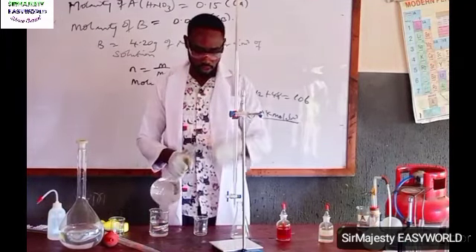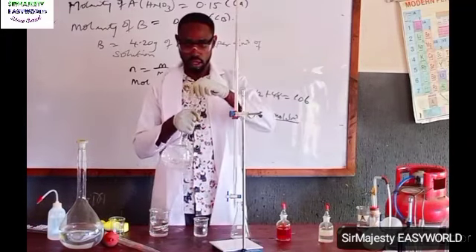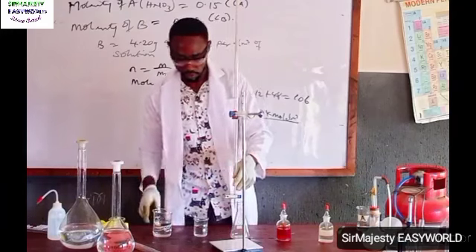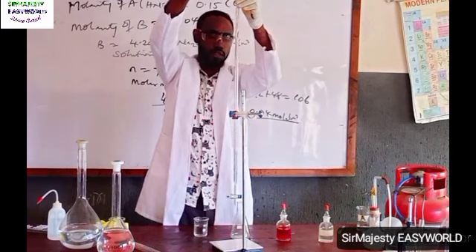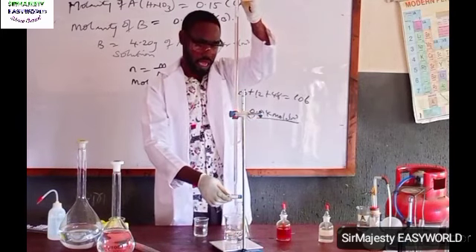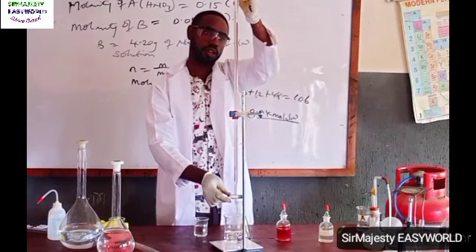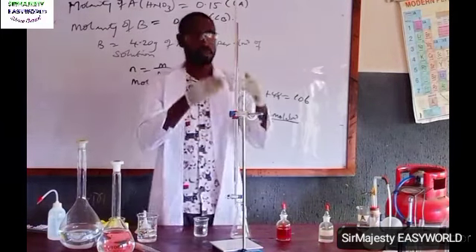Endeavor to tell your students not to waste any of the reagents. I've collected more samples. So what I do first is close the tap. Fill. Remember to avoid a bubble. You are filling. So bring it back and restore this to the lower meniscus of the 0 mark. Okay, then that's our 0.